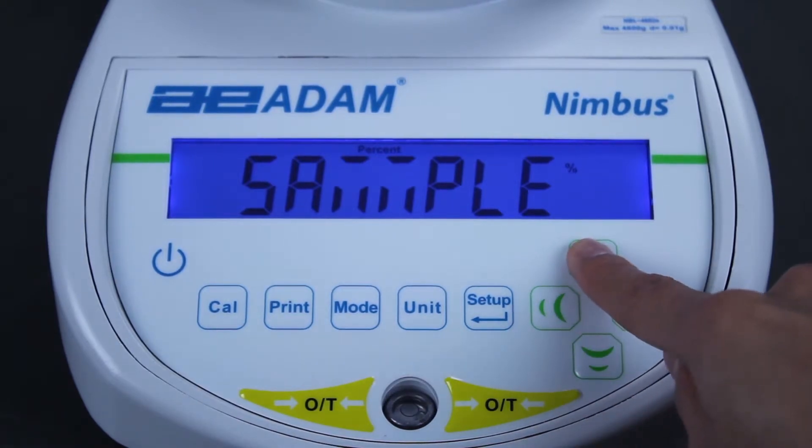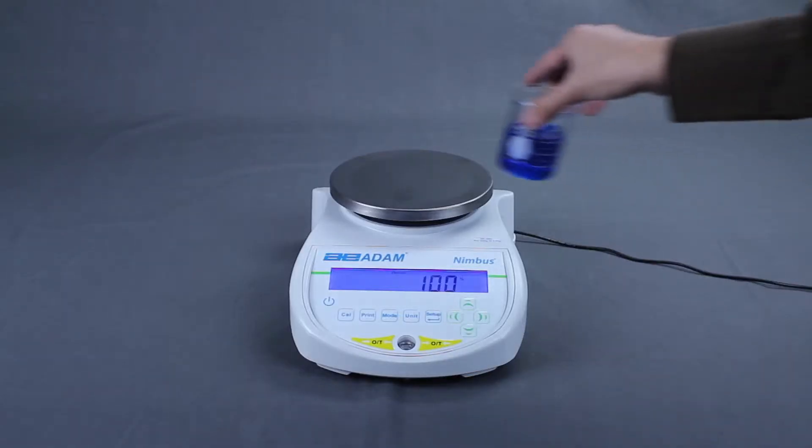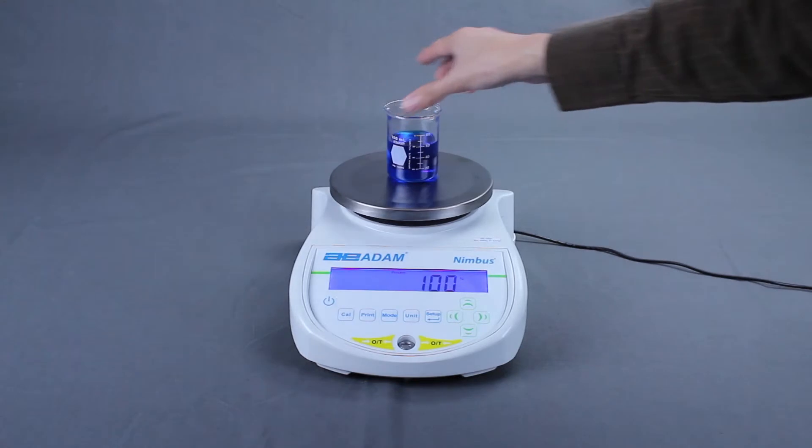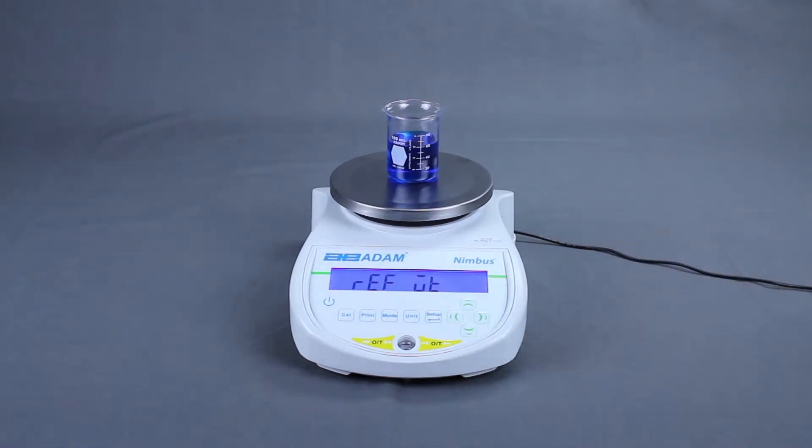Select the sample method. When the display shows LOAD 100%, place the reference sample on the pan. Wait for the stability indicator, then press SETUP ENTER.